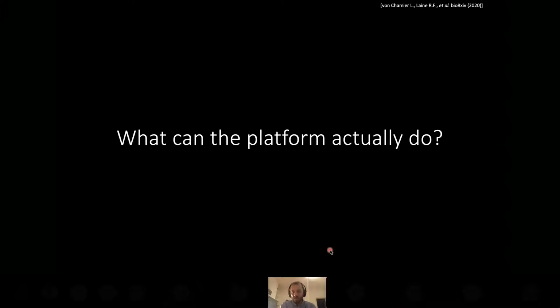But what can the platform actually do? And I should highlight something absolutely clear at this stage: the added value that our work provides is basically a consistent set of notebooks that are based on currently state-of-the-art image analysis neural networks that were developed by great computer scientists around the world, and we've re-implemented those neural networks to be integrated within our platform. So we haven't created any neural network at this stage. And so what can the platform actually do?